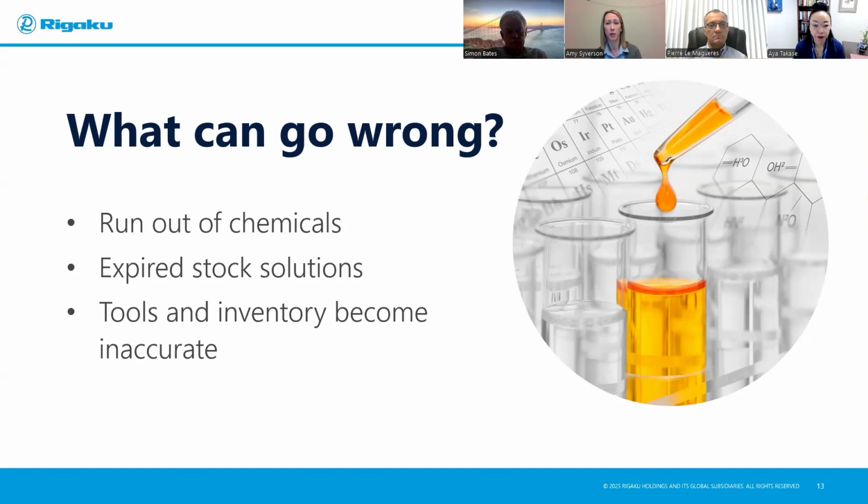Contamination is also a risk that can be avoided by using aseptic techniques. Reducing the number of times that you're opening and closing a bottle will help with that.